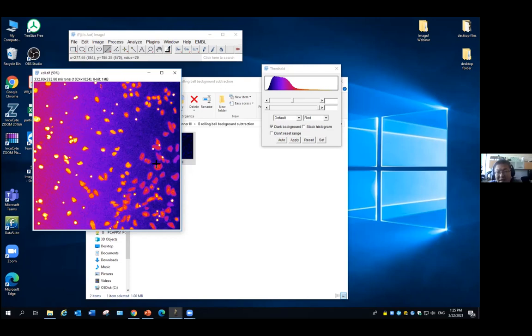But now let's say, in a less ideal reality, the image is already taken. Those are live cell images. The cell is long gone. I took it last month, and then I just realized this problem. Can I still use this data? Yeah, probably you can. We can try to solve it. But just keep in mind, this is not the ideal case. You should go back to your microscope and make sure the raw data coming in is good, right data.